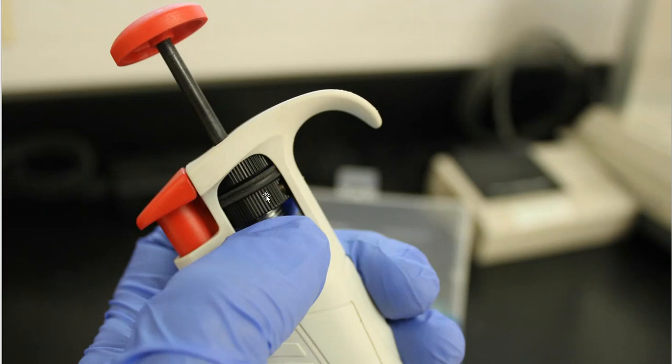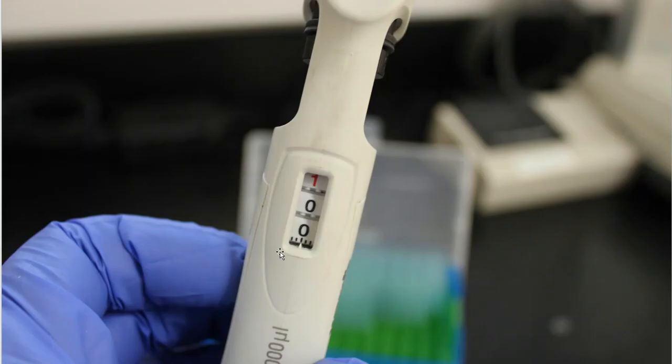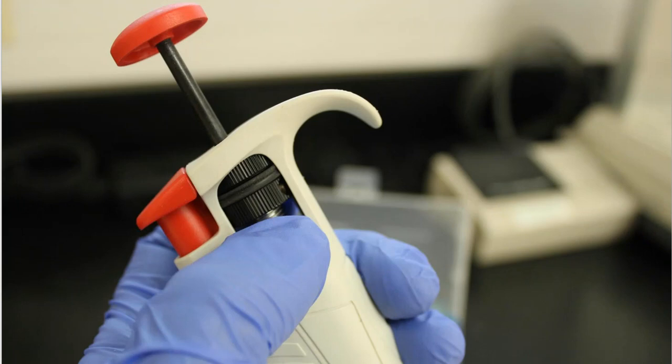Over here to the side, up here at the top, you're going to see a dial. This dial can be turned, and that is what will adjust the numbers that you see on the micropipetter. So this is how we adjust for the volumes that we actually need to be pipetting.